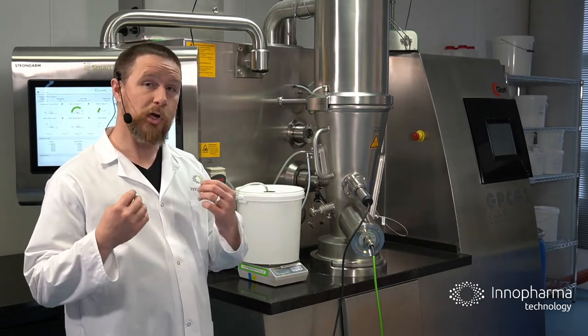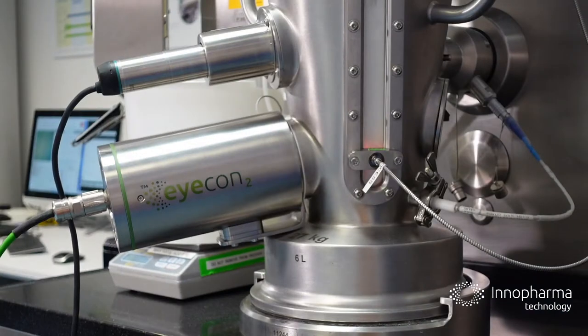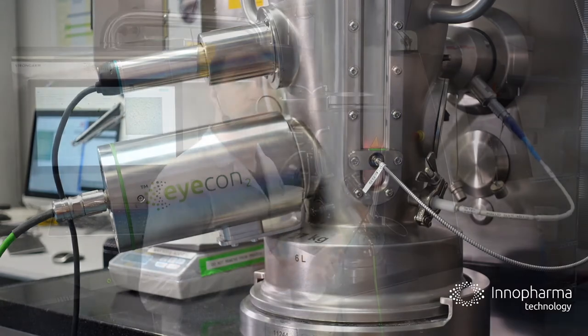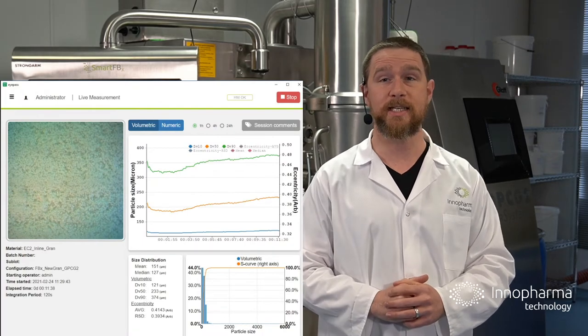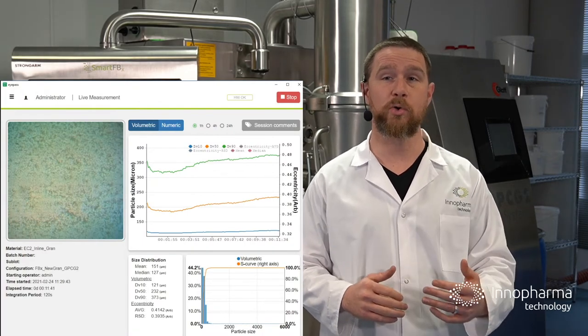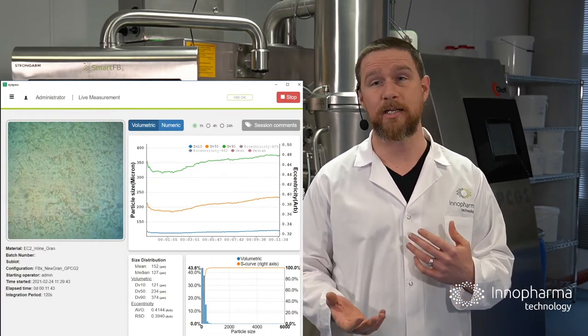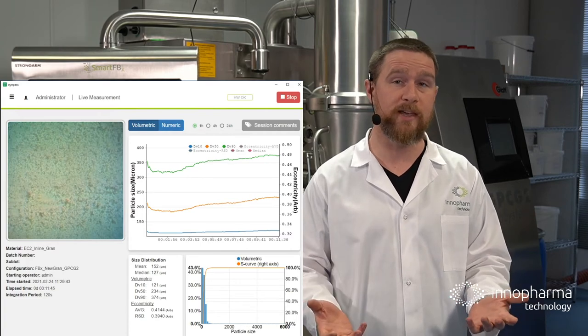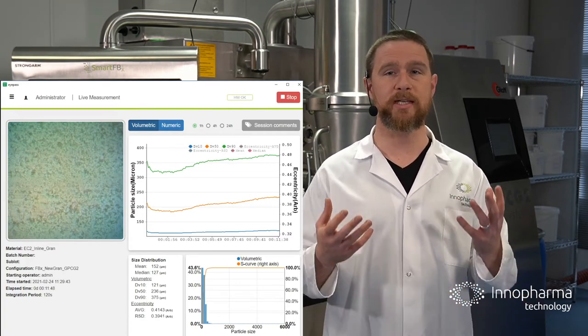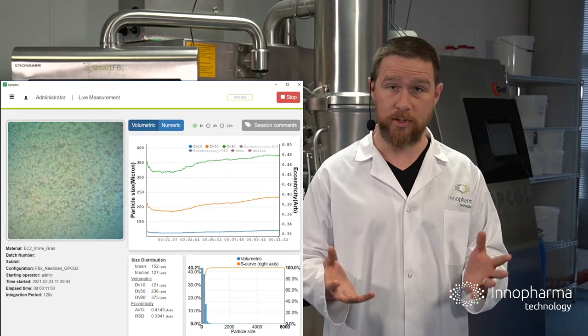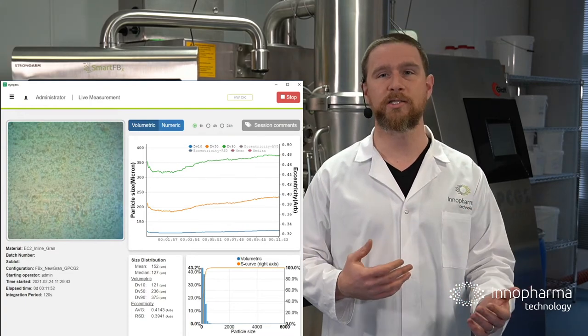Now if we take a closer look at what's happening inside the process, we can see the ICON2 is measuring in a non-product contact, non-destructive fashion through a pre-existing process window here. And when we look at the software iPass, we can see the live D10, D50, D90 data which has been automatically recorded and stored. This is particularly useful for continuous process verification environments, and this data can be used for building automated particle size control into your process via protocols such as OPC.